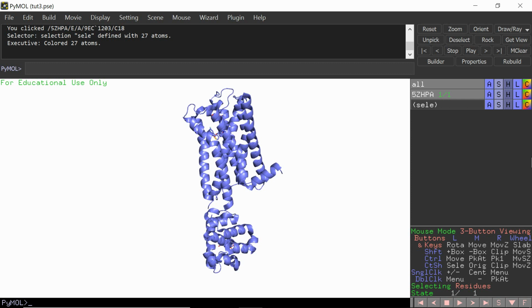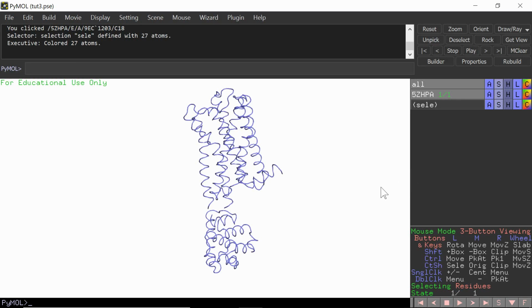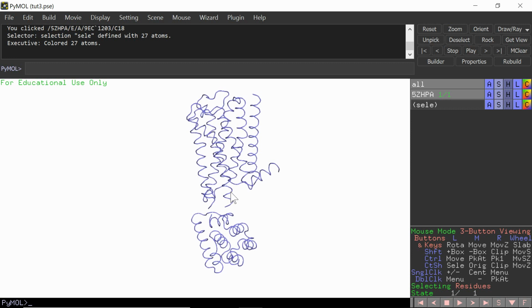This isn't very useful for making informative structures, as beta sheets and alpha helices aren't explicitly shown when using ribbon, but this can be useful when you're trying to change up the style of a visualization. For most applications, however, it is recommended that you use cartoon. Here's an example of using ribbon. As you can see, you can't really clearly distinguish a whole bunch of the secondary structure.